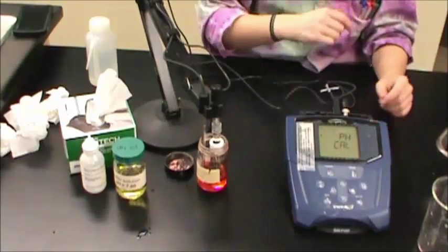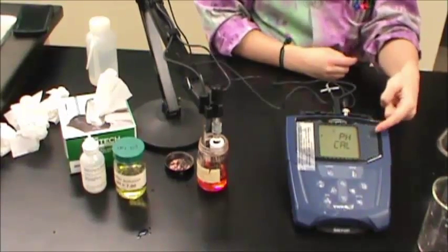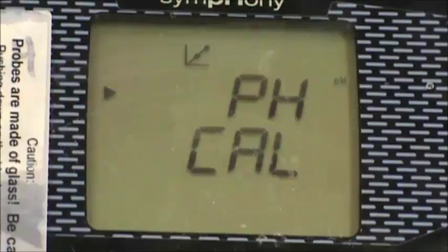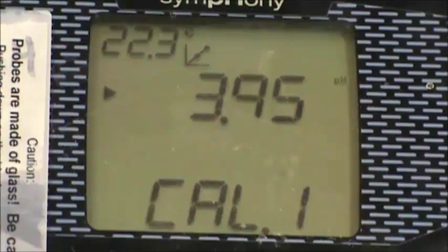Go into calibration mode by pressing CAL on the instrument. The screen should read PH CAL, then automatically change to show the pH reading of your solution and CAL 1.